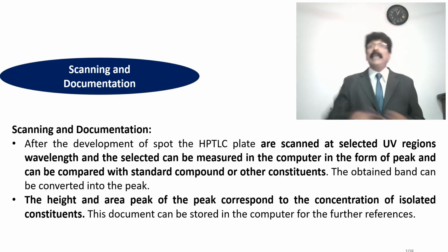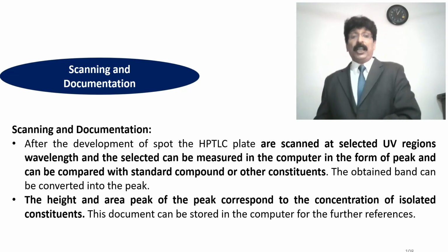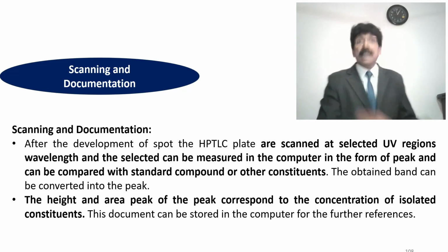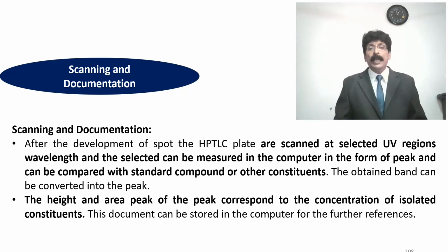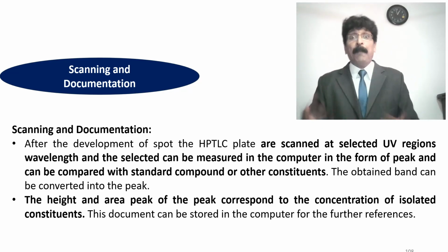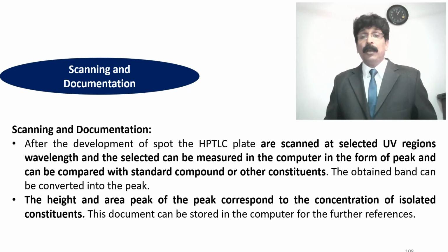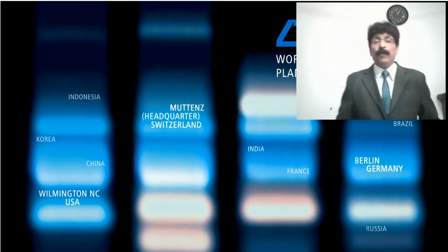The height of the peak and the area of the peak correspond to the concentration of the isolated constituents, which can be compared with a standard. This document can be stored in the computer for further reference also, and the sample after derivatization can be kept in the slide, also kept safely for the documentation.